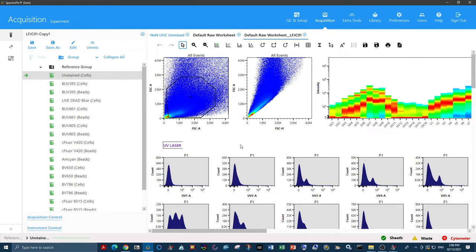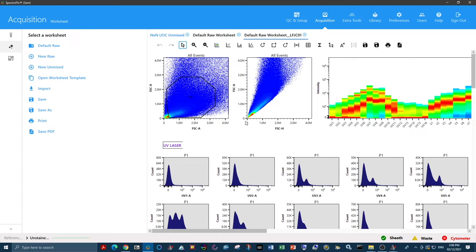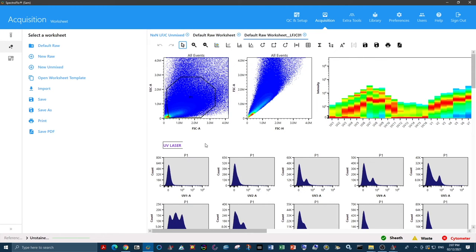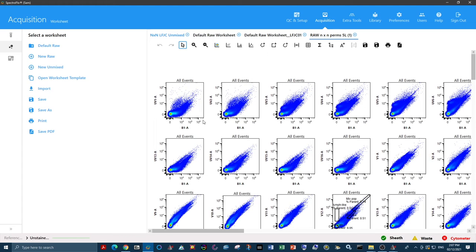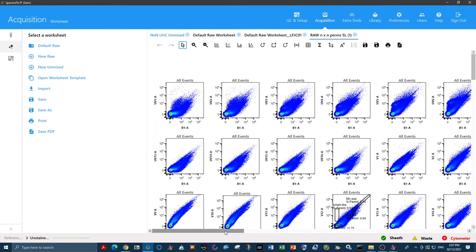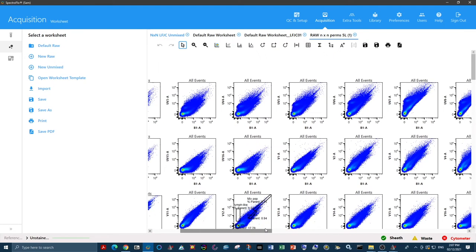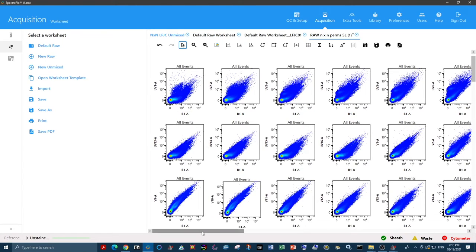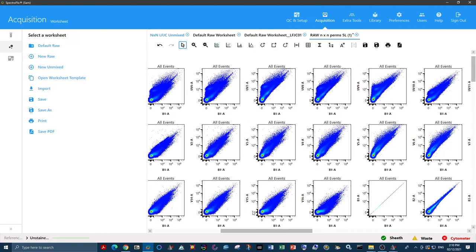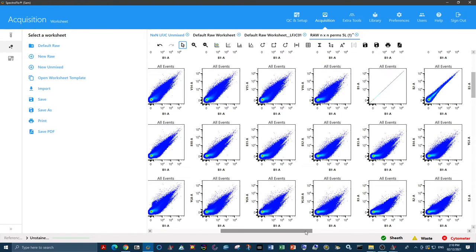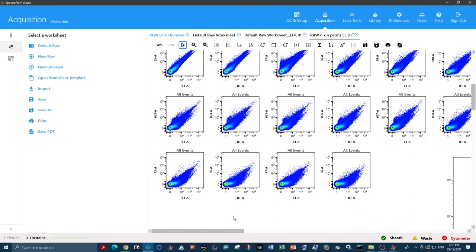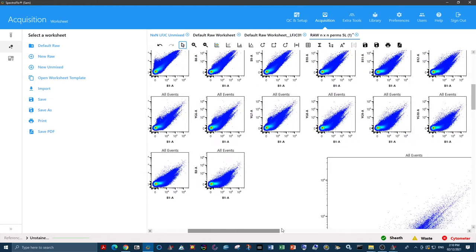So the first thing we have to do is discover our different autofluorescence spectral signatures that we have in this sample. We need to open a worksheet template which has a raw n by n permutations. This will compare all fluorescent channels against each other in the raw format. We look through all of these plots to check for populations that are separated from each other and distinct.